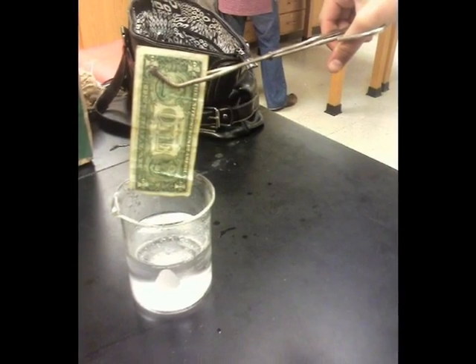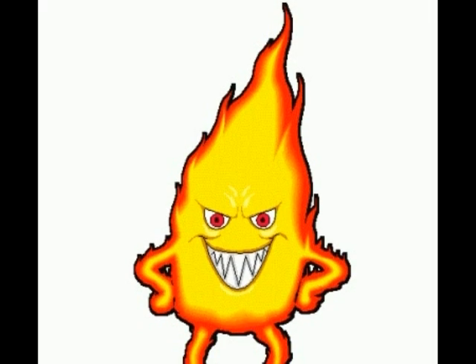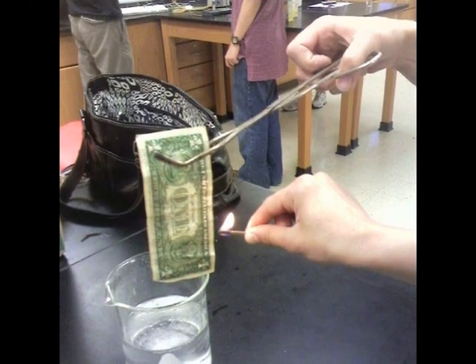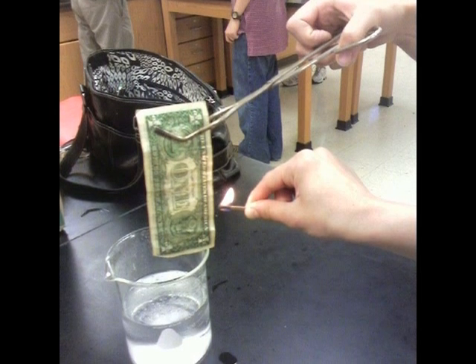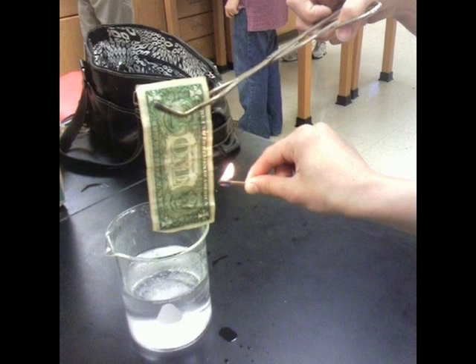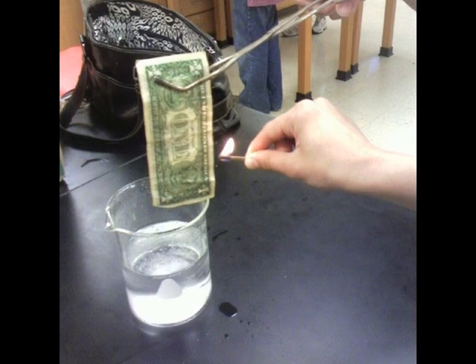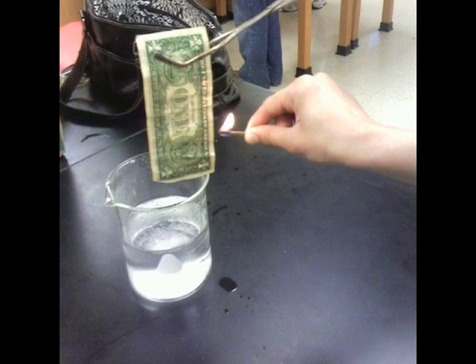Using the metal tongs, pick up the $5 bill. This next step is dangerous, so it's important that you follow directions very carefully — not that you shouldn't have been doing so all along. Move away from the solution. This is very important because the solution is flammable and we do not want it to burst into flames. Then, light the $5 bill on fire with the matches.